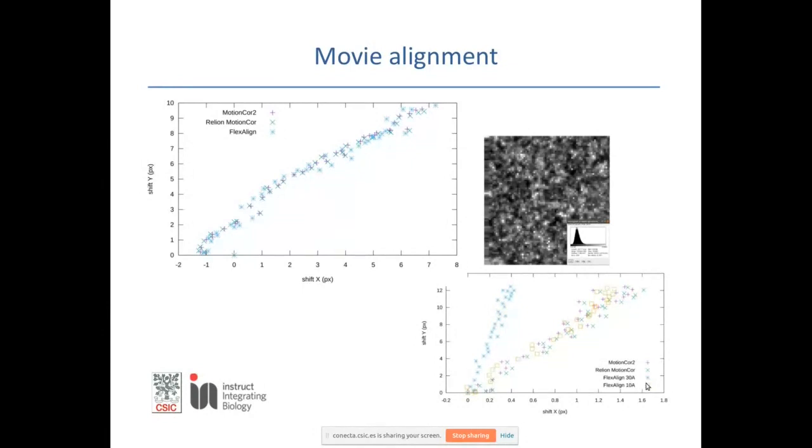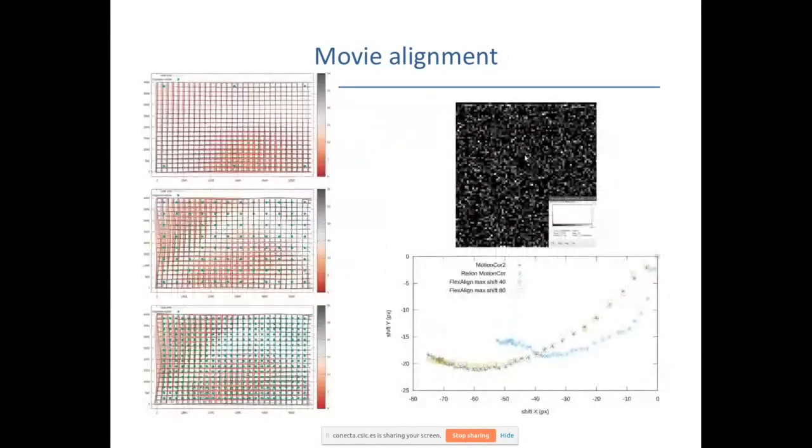this low pass filter of 30 angstrom. If you put it at 10 angstroms, then it was correct. And when we went to the frames, this is what we saw. Somehow in this data set, the frames had been pre-processed, and then the pixels didn't look anymore like this Poisson distribution.